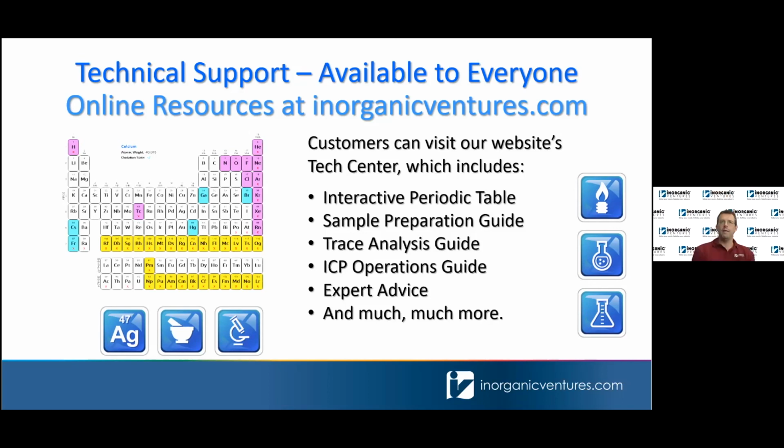Great, thanks guys. Another question regarding mercury. If mercury can become sticky in the presence of nitric in the nebulizer, can other elements like calcium, silicon, or perhaps iron stick as well? I think the question really is, are there other elements that can stick in the nebulizer like mercury? And if for any reason I'm not quite addressing the question as I read it, I would ask the participants to please just let me know.